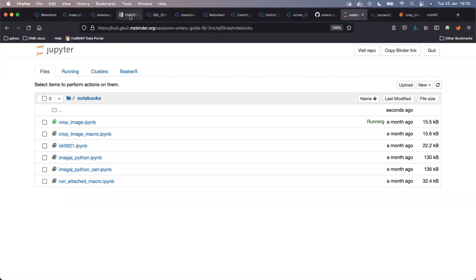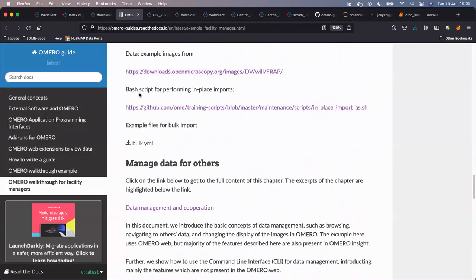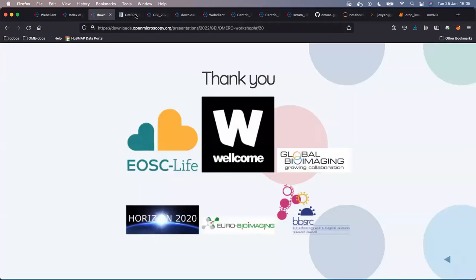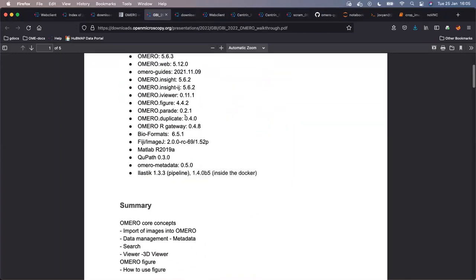For you, the most natural way to approach that is, let me go back to the OMERO guides, or even to our walkthrough, pardon me, the GBI 2022 OMERO workshop.